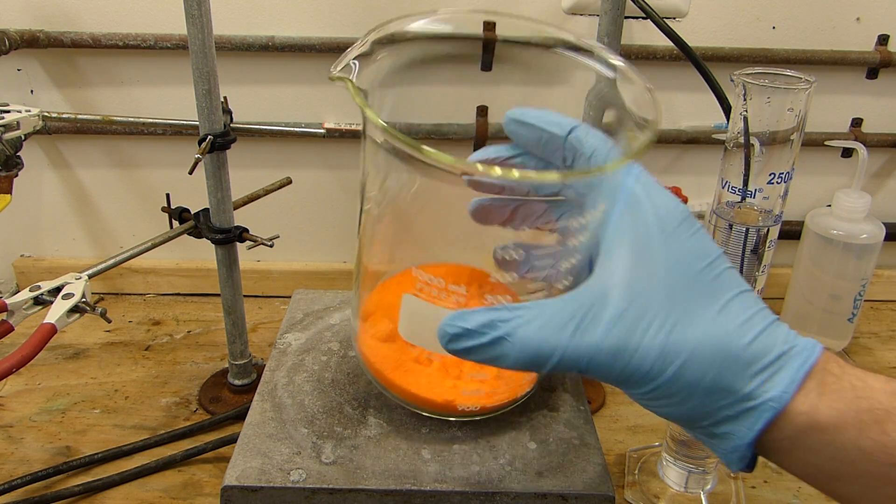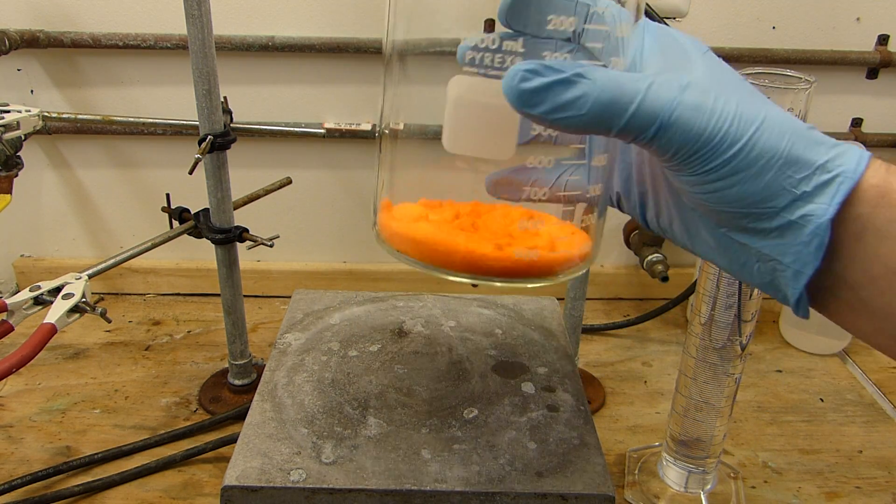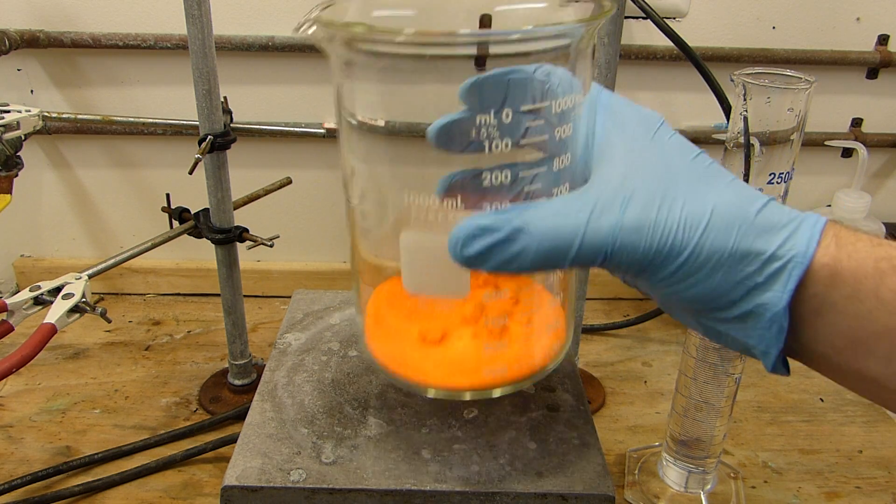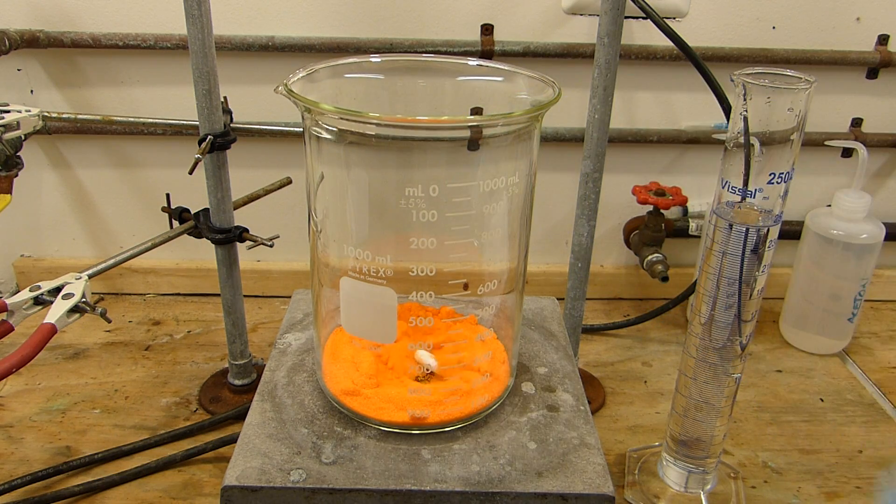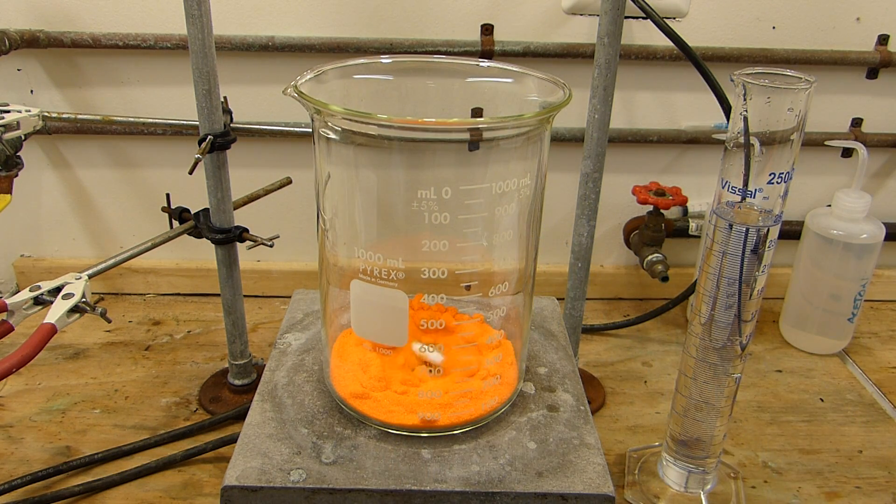I'm going to start with 100 grams of sodium dichromate dihydrate and I've added a stir bar to that. Get it on the plate and we'll start some stirring here. The stir plate's rather powerful, I kind of like that.